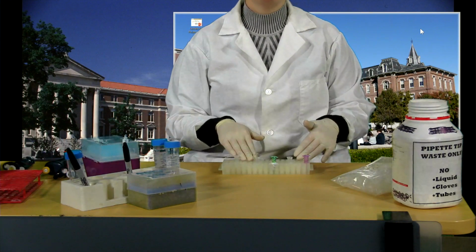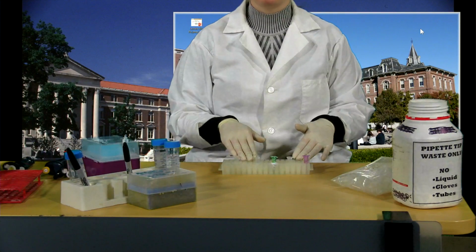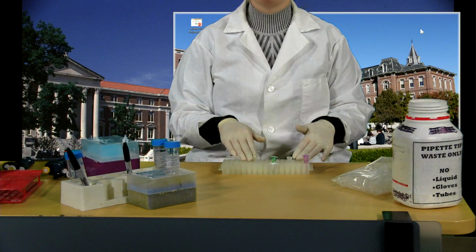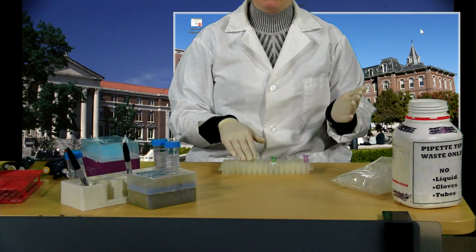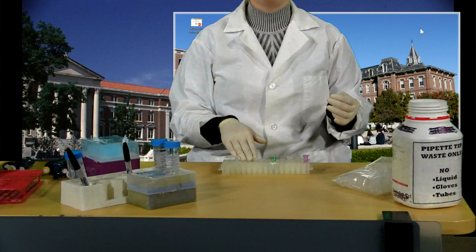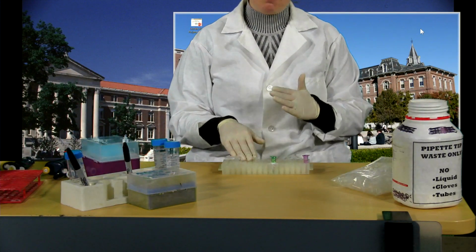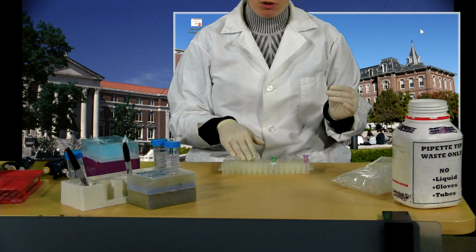You do need to think about it, because it's not going to be the same for every single assay that you do. When we were doing the LDH assays, time was much more important because the assay reaches equilibrium incredibly quickly, and so we need to be able to determine the initial part. And so you'll remember when we did the LDH assays, we didn't add the substrates and the enzyme together until right when we were ready to measure the absorbance. So we don't need to worry about that quite so much at this point.